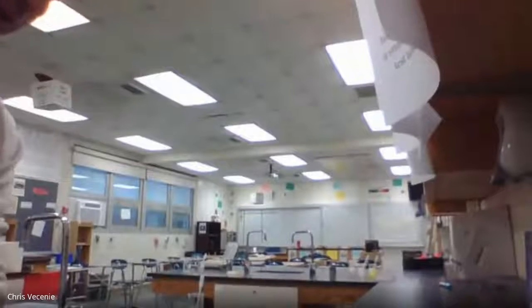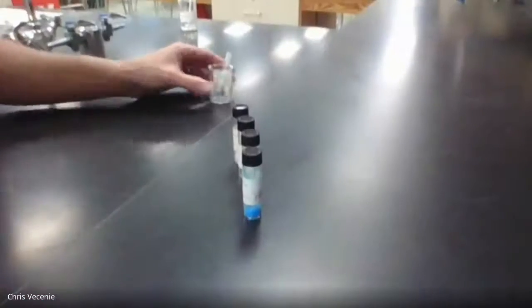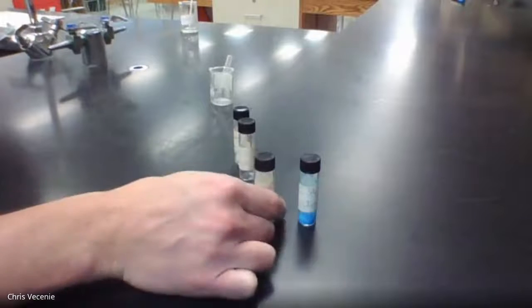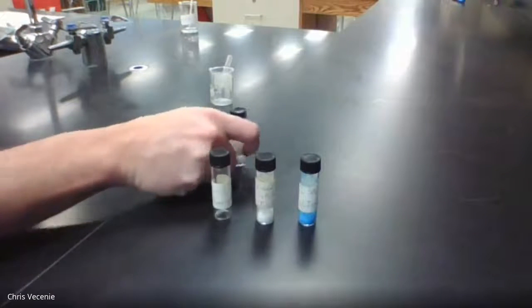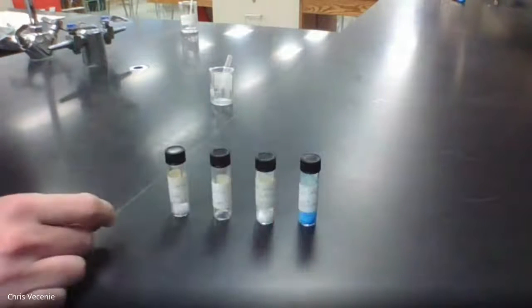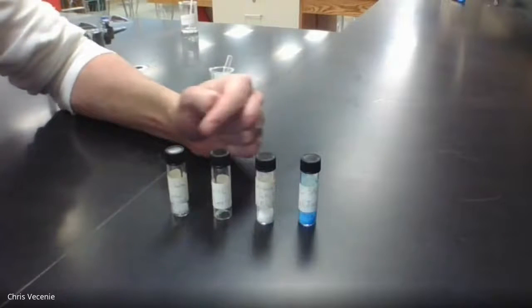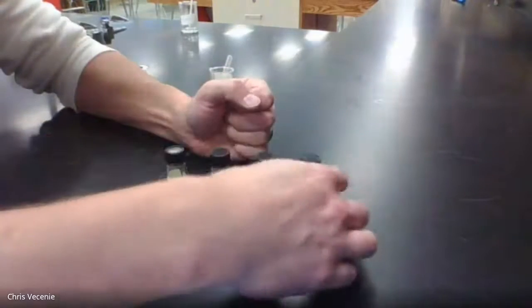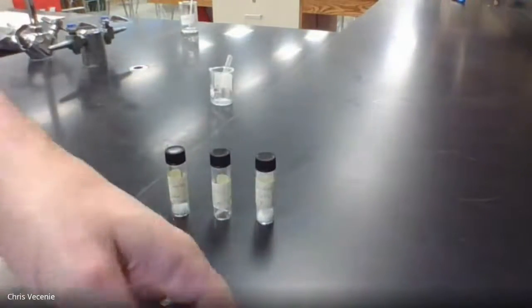When you guys come back to the lab, usually the first thing you would do is you would run tests on a series of the known substances. All right, so here's your copper 2 sulfate, here's your dextrose, here's your zinc, here's your paraffin. You would just run around the back with your known substances and you would start testing things.